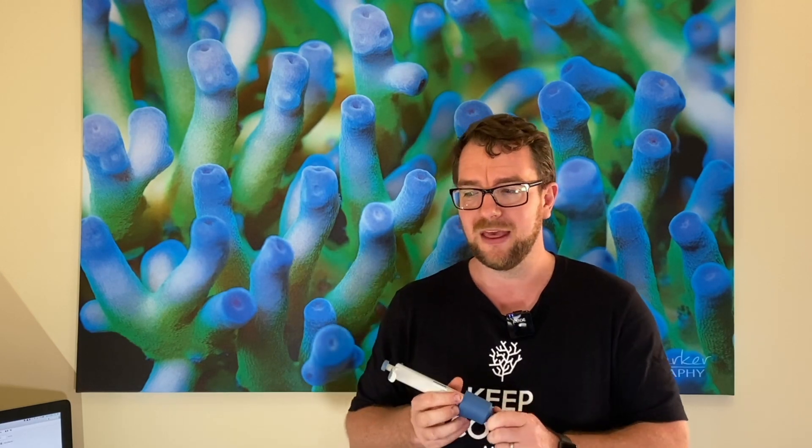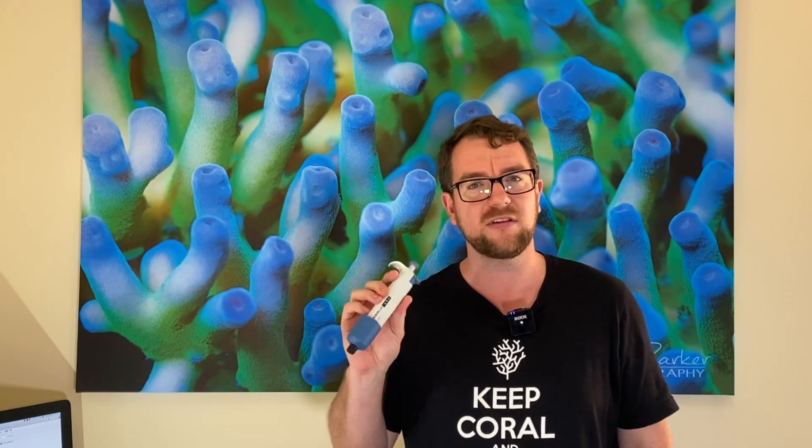They've got this nifty little hook here which just hangs on any sort of workbench. They're really simple bits of gear — fairly common in the science and chemistry field but you don't see them a lot in aquarium use. Personally I think they're a really good little bit of gear. I've popped a link down to an eBay seller in my description — I get absolutely no kickback on that, it's not an affiliate link, but if you're interested you can check that link or search eBay or Google for 'adjustable pipette'.